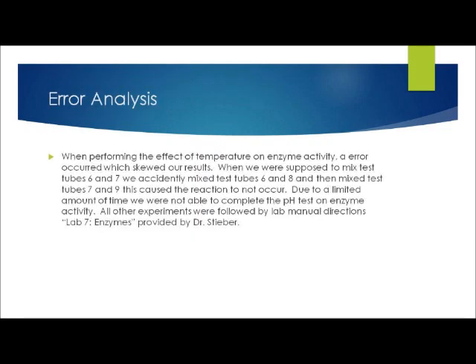Error analysis. When performing the effect of temperature on enzyme activity, an error occurred which skewed our results. When we were supposed to mix test tubes 6 and 7, we accidentally mixed test tubes 6 and 8, and then mixed test tubes 7 and 9, which caused the reaction not to occur. Due to a limited amount of time, we were not able to complete the pH test on enzyme activity. All other experiments were followed by lab manual directions.